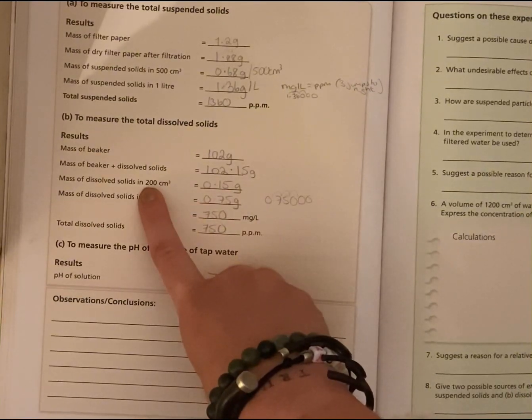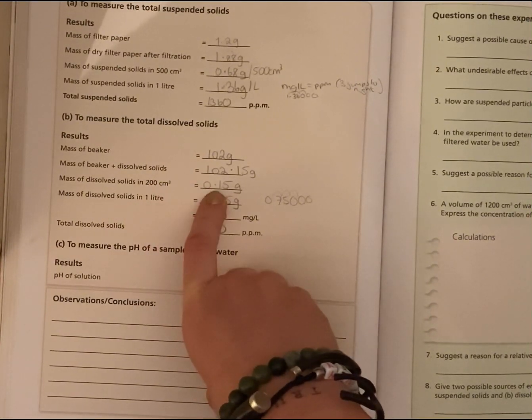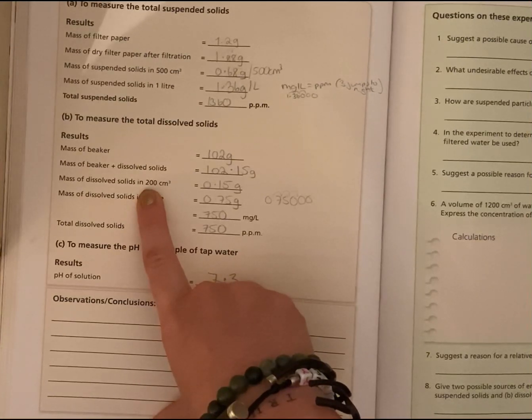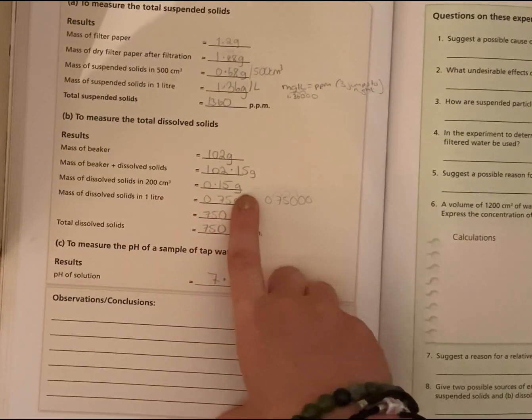And that was only 200 centimeters cubed of water. We don't want to use too much because it will take a long time to evaporate, but we need a substantial amount so the percentage error is small. So if that's 200, I want to get into per litre for our concentration.